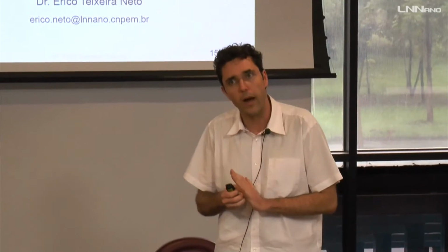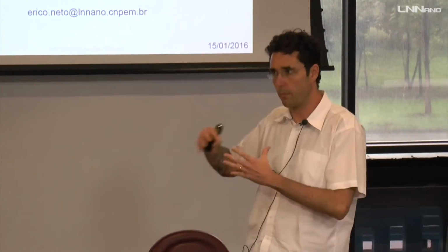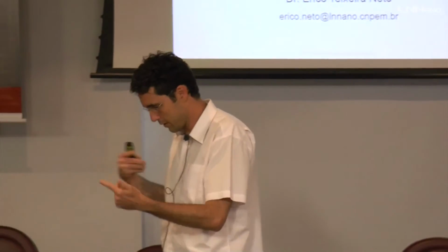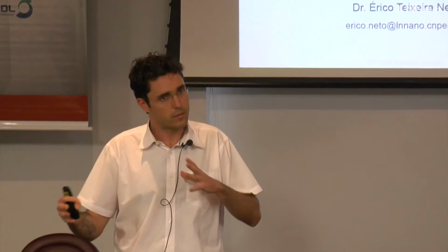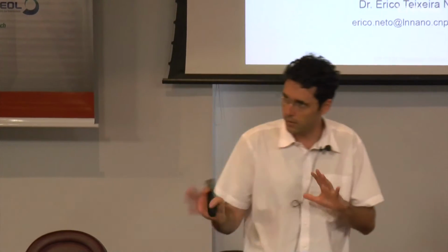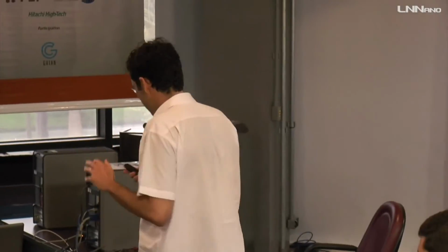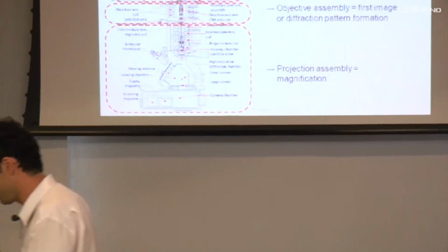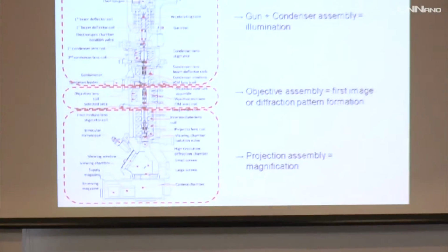I will just acquire the images in this remote operation and try to see some parameters of alignment that can change the characteristics of the images. I have here a small amount of slides about it.